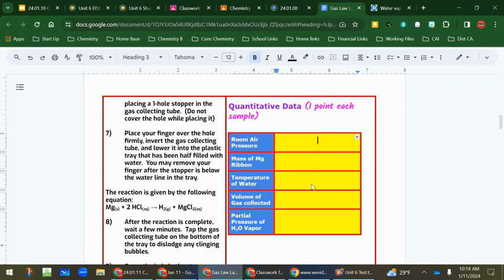Now again, we had 20.4 or 20.8 and 18.3. My guess is one of those thermometers isn't very good. I don't know which, but that would be my guess. But you have to go with the numbers you have. And then finally, ladies and gentlemen, you had the volume of the gas that you collected inside the tube when you equalized the two of them. And we had the partial pressure, which you just looked up on the table. Is there anyone who needs any of those numbers?